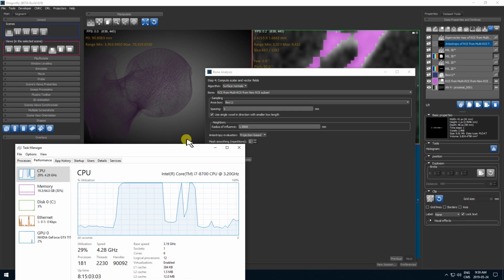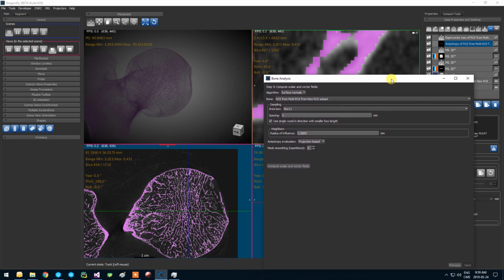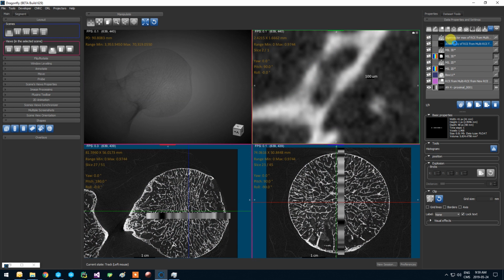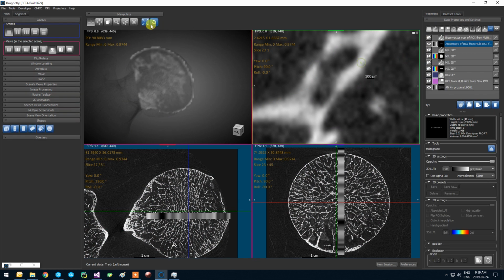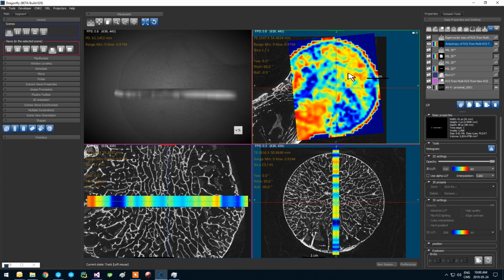Okay, so this one I will put it down, and we'll look at my results. Bring that in, and in jet. So you can see an interesting effect in here. The growth plate was not so visible. Maybe I didn't have the proper place.